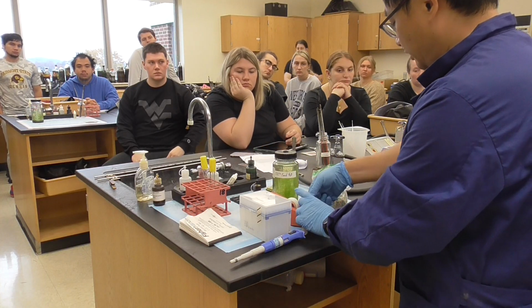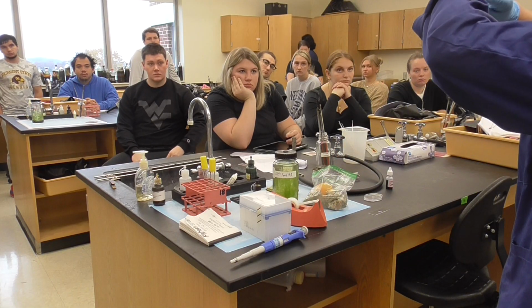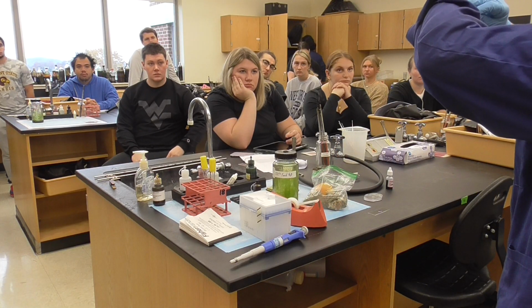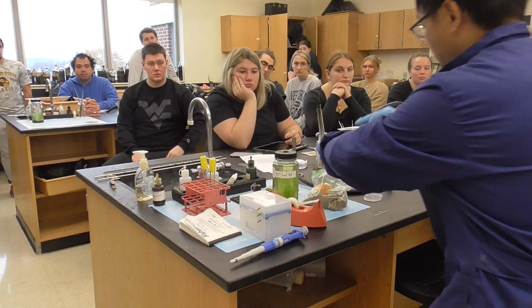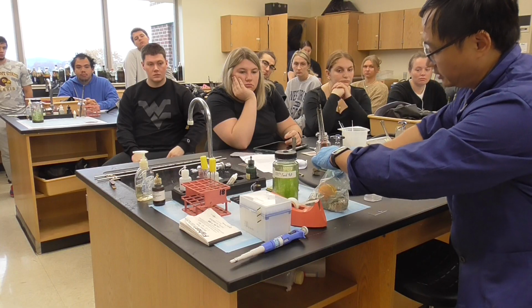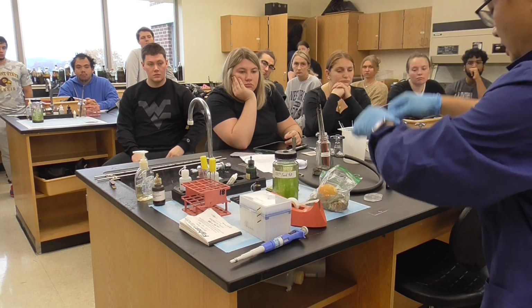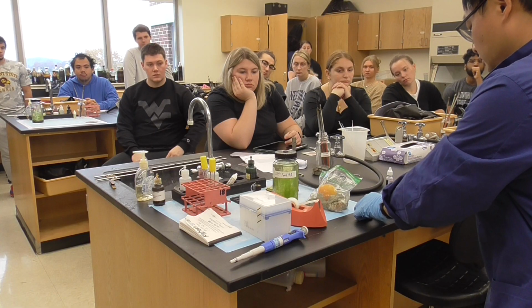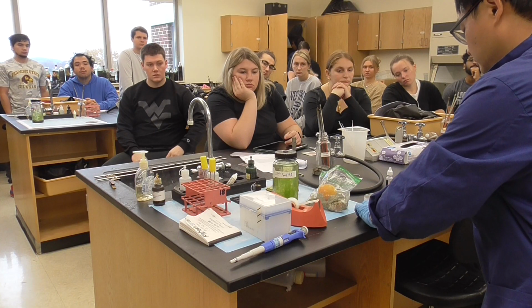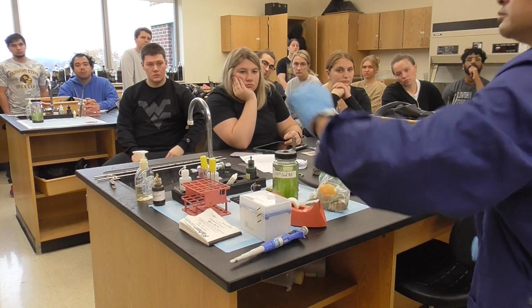We have a tape there. Hold it like this, then you go inside, touch any area. That's good enough. Then go to cover. That's done.